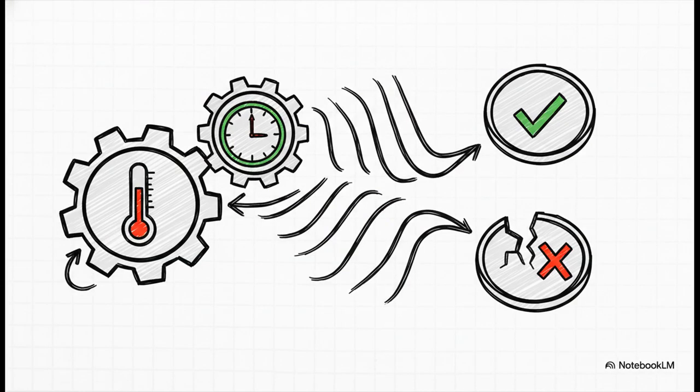And this is why immunoassays are especially tricky customers. They're not simple A plus B equals C systems. They're these complex webs where everything is connected. The coating density interacts with your blocker chemistry. Incubation time interacts with temperature. This coupling means a teeny tiny shift in one thing can cause these unexpected ripple effects, making an assay that looked perfectly optimized suddenly fall apart.